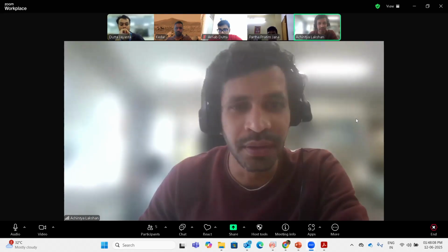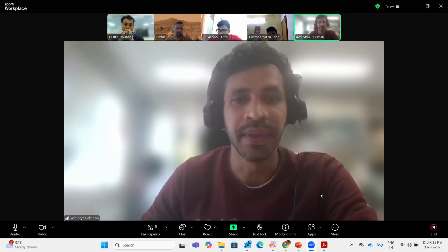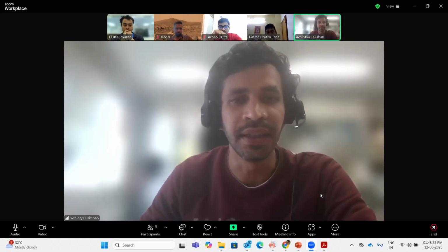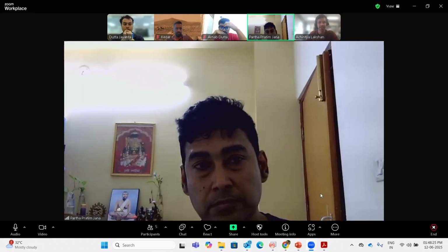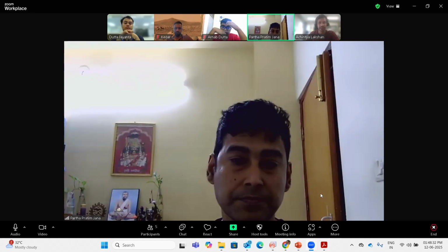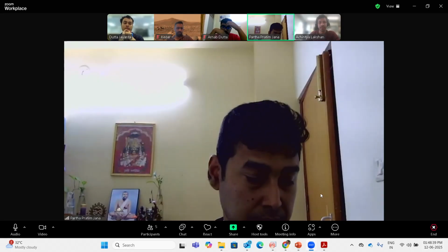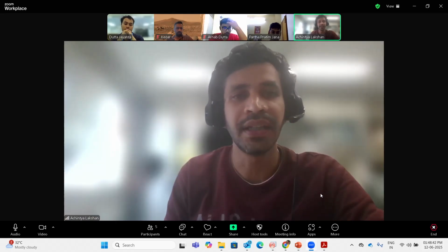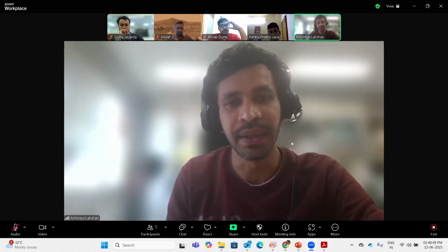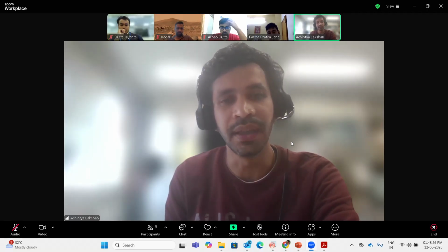Yes, sir. So actually, sir, the question is now about the phase transition. We have a couple of questions about the phase transition that we have observed, and there is another phase transition, with some peaks in the DSC curve around 300 degrees centigrade. Those are the two major questions we have to address. As we have mentioned, single crystal growth can help. But I want to ask: if we cannot make a single crystal, can we directly use the powder sample to check the diffraction pattern, like the SAD pattern? Probably the low intensity peak is not visible in the powder XRD pattern.